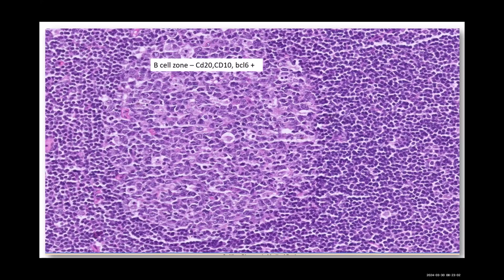When you read about these, it's interesting that the centroblasts are the ones that give rise to centrocytes. So the stimulated memory B cell, when it gets the perfectly fitting antibody to the corresponding antigen, undergoes a centroblastic transformation. You see these large cells over here, those are your centroblasts. Then these centroblasts divide into centrocytes. They go to the germinal center, and the centrocyte with the highest affinity receptor is the only one that stays, the others die, and one goes back into the mantle zone as a reservoir. So what happens is you have a lot many.